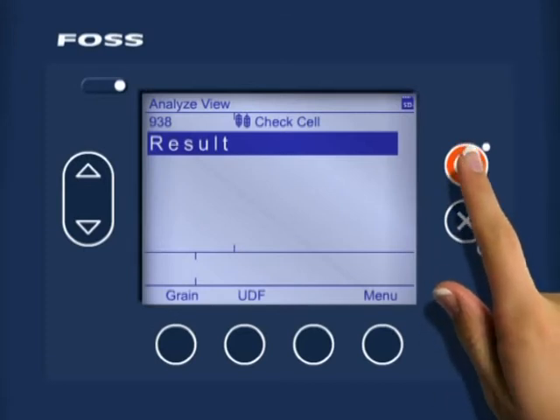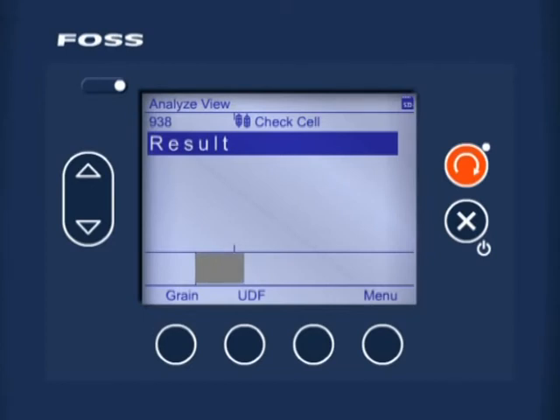This operation takes about three minutes, and the time remaining is indicated by the progress bar moving from left to right. This screen shows the successfully completed check cell analysis, and the result 'pass' is now highlighted.